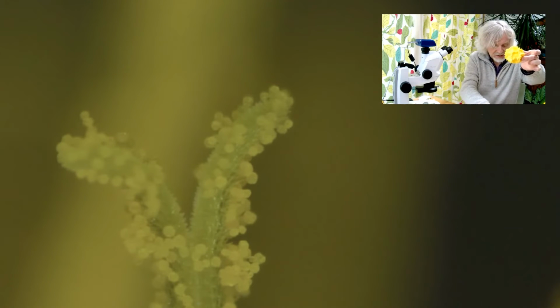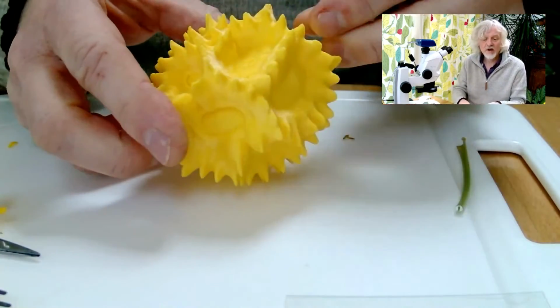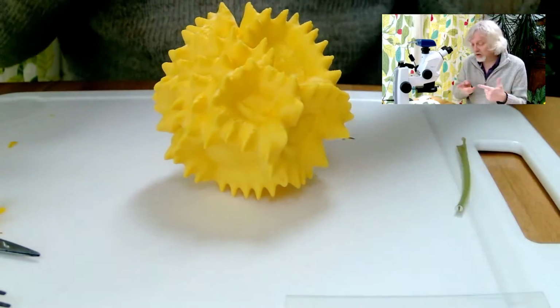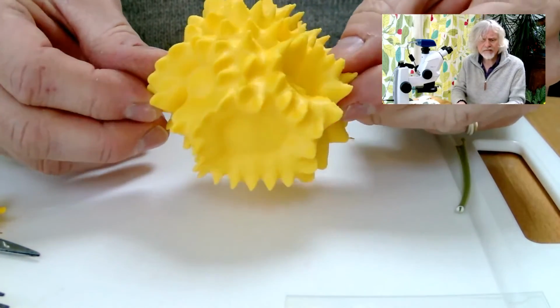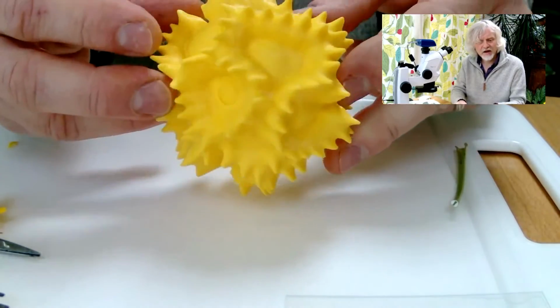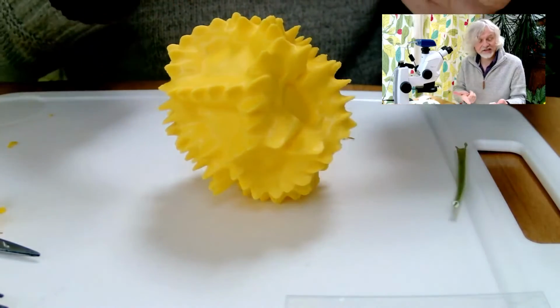And if I turn my desk camera back on, I can show you the pollen grain. So this is what a pollen grain from, well, it's actually a very closely related species. This is autumn hawkbit, which is very closely related to the dandelion. Look, there's a little face there. Hello. And it's regular, and it's covered in these amazing spikes. And every single one of those pollen grains looks essentially like this.